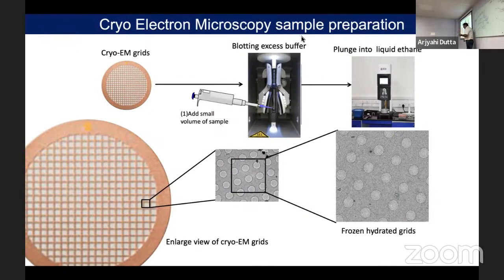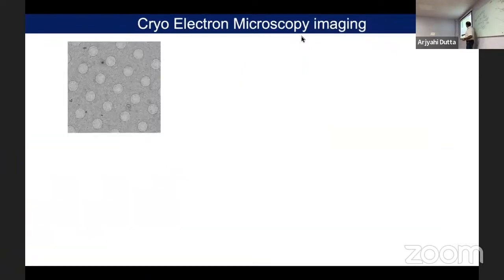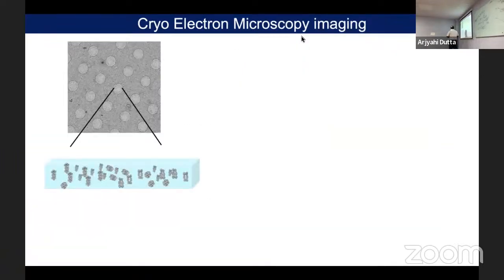So we are targeting the individual holes here. Okay, if we look at an individual hole, as I mentioned, you will see an amorphous ice layer. Within that, the protein is embedded. It is like you are baking a cake and you have creams or nuts, you are putting them in, and they have different orientations. Same thing. Consider that it is a cake and the proteins have different orientations.